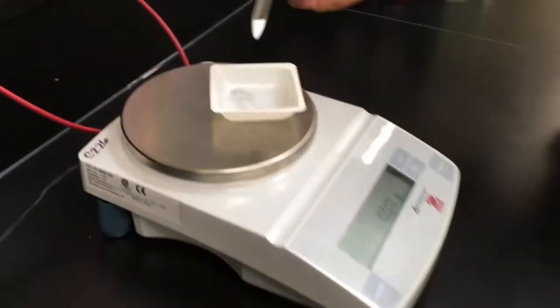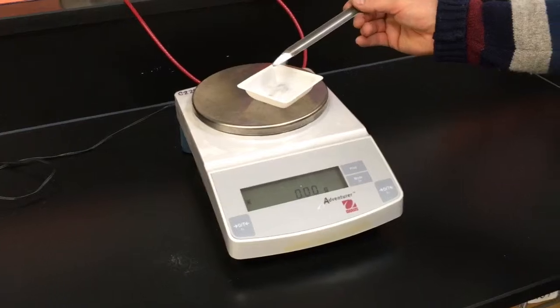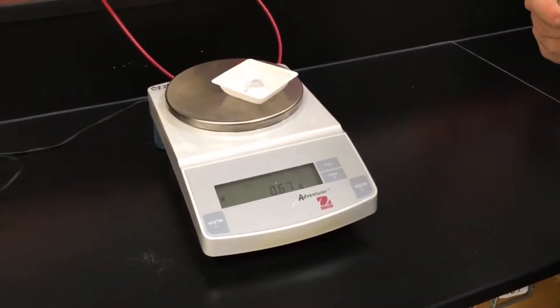All right, I'm gonna go in there, get my powder. Now I tared the boat because I want it to say 0.00, so I don't want the weigh boat to factor in. So now when I add the powder, I'm just getting 2.1 grams.